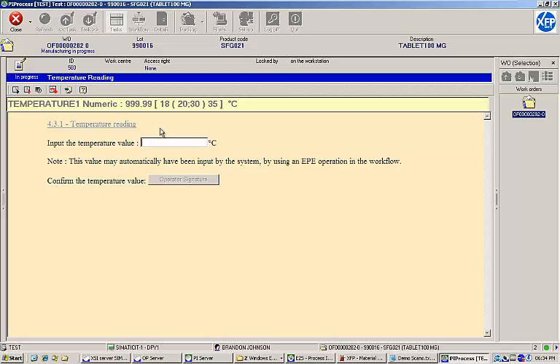Here, we're asked to input a temperature reading from our solution. I'll enter a value of 20 degrees Celsius and provide an electronic signature.